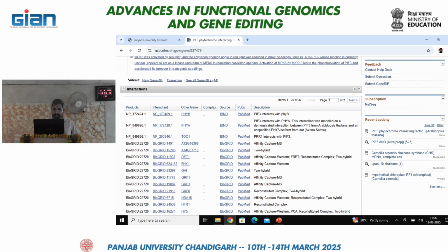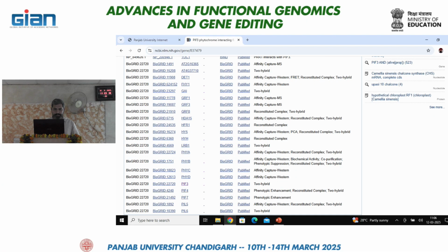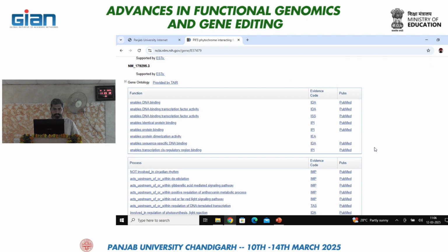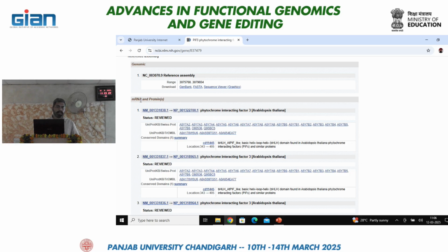Okay, I think I got what your confusion is. After scrolling down, here you will see mRNA and proteins written, and in that NM is our mRNA and NP is our protein, so we want this, so we will click on this.